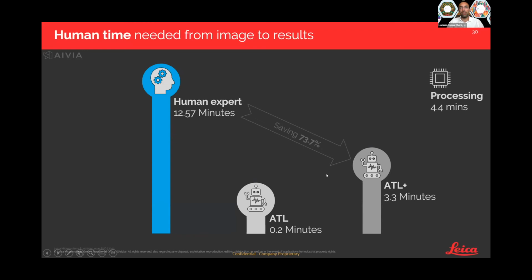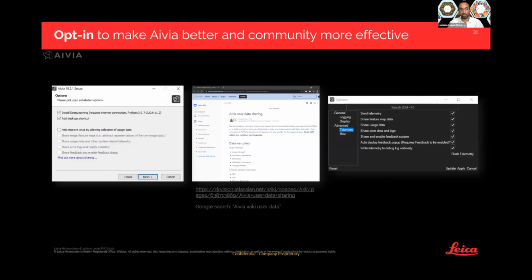Instead of letting the human do all the iterations on his own, we just provide a preview, which is pretty solid, and the human needs to maybe adjust one parameter or two parameters out of the many that are available. So I'm getting to the very, very end.